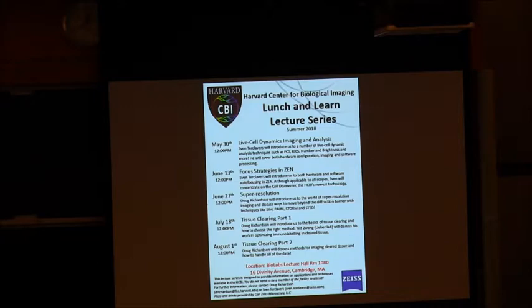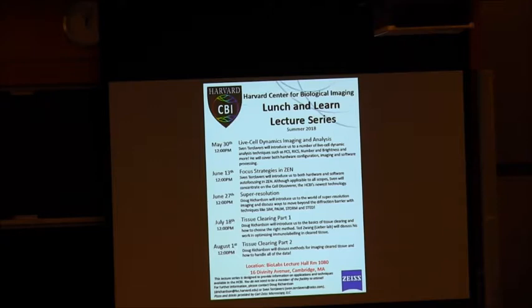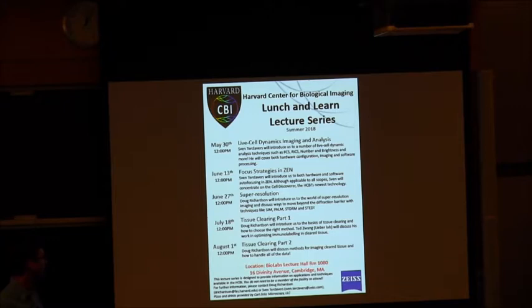Immunostaining definitely seems to be one of the most difficult parts of tissue clearing. If you can avoid it with genetic reporters, that's definitely preferred. But if you do have to do it, Ted's done some incredible optimization of his samples, which won't necessarily translate to your samples because we're finding that every antibody and every piece of tissue is very different. But it's going to give you some good ideas of some of the things to watch out for.